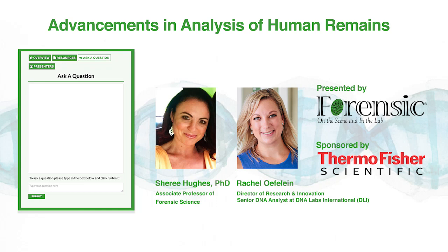Our first question for you is, what is the oldest bone you have obtained a profile from? I'd say the oldest bone that I've obtained a DNA profile from was from the 1800s. So really, it depends on the bone condition, because we've also had bones from the last decade where you struggle to get a profile sometimes. It has to do with the environment that the bone has been in and how the evidence has been preserved.